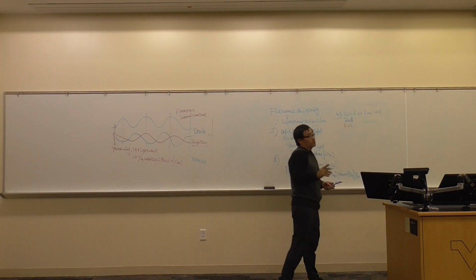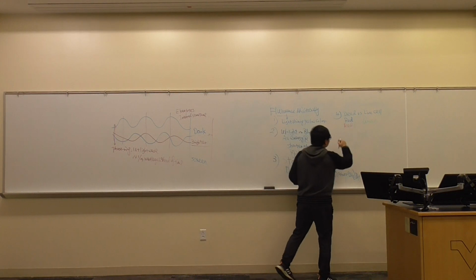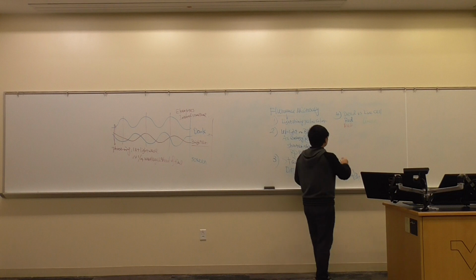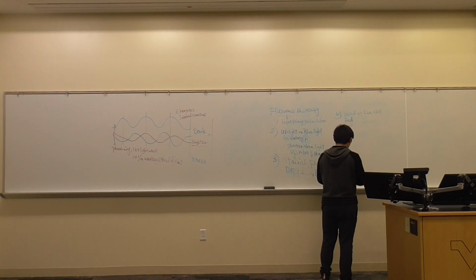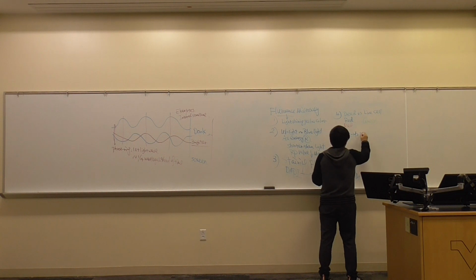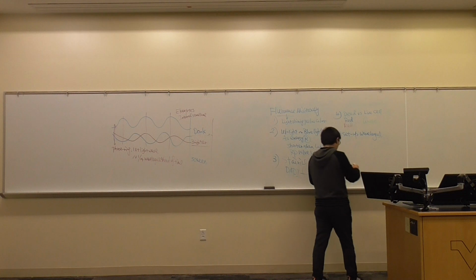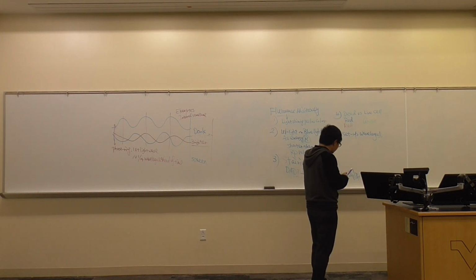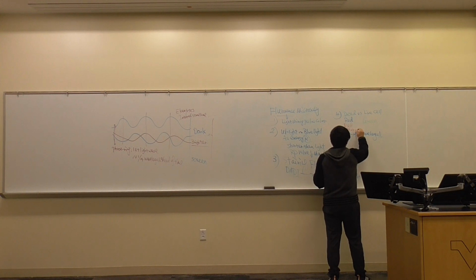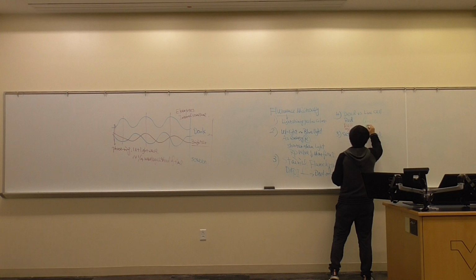Now, obviously, another thing we need to do, because it's going to show color, is set up wavelengths. That's something different. You need to set up wavelengths ahead of time. Red is approximately 710 nanometers, green approximately 550 nanometers.